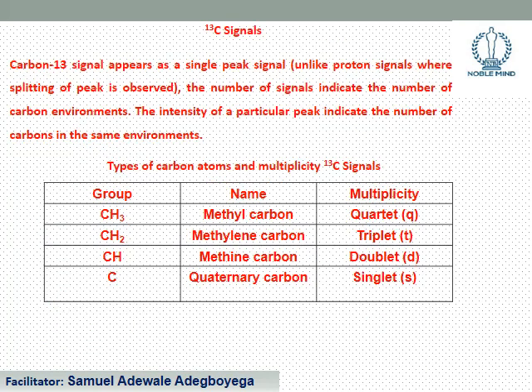Let's talk about signals in carbon-13. Unlike proton NMR signals, which are split due to coupling by neighboring protons in the environment, carbon-13 appears as a single peak.